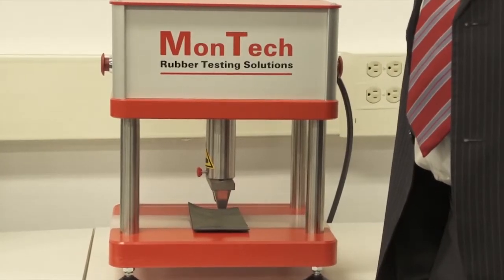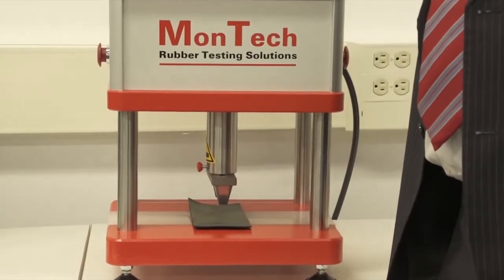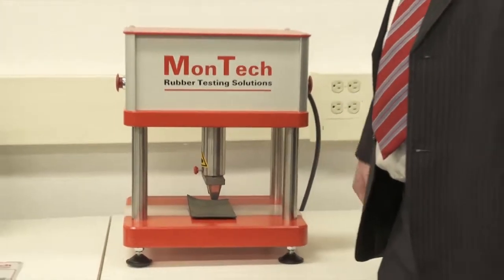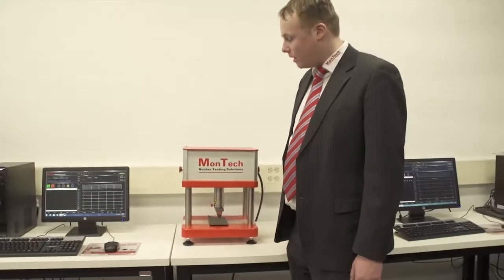Every Montec sample cutter is fitted with anti-tie-down protection, as well as protective safety covers on the sides and back side of the instrument.